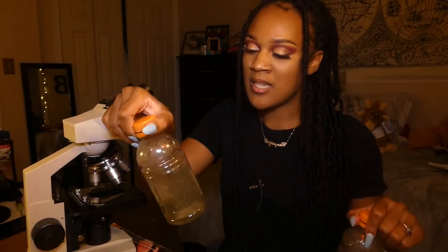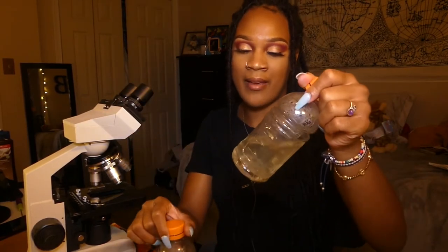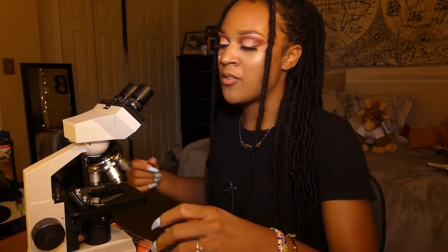When I took the samples, I tried to make sure to get some sediment and some algae, because those are where most of the microbes would be. There's not many microbes on the surface of the water. You gotta get in there. You gotta get in the sediment. You gotta touch the nasty stuff.